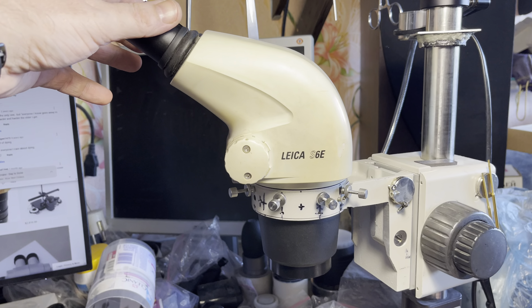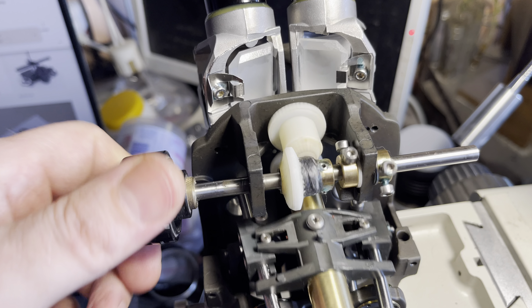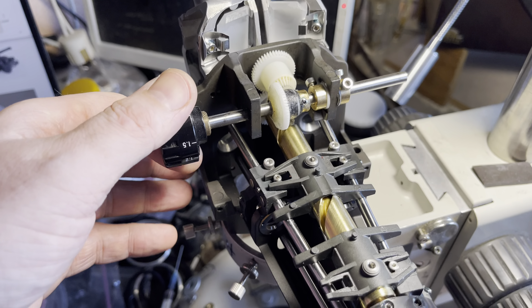In my case I have restored this gear on both sides with my usual method. If you look at the mechanics, Leica has a very prominent way of making things mechanically, so let's look deeper inside.